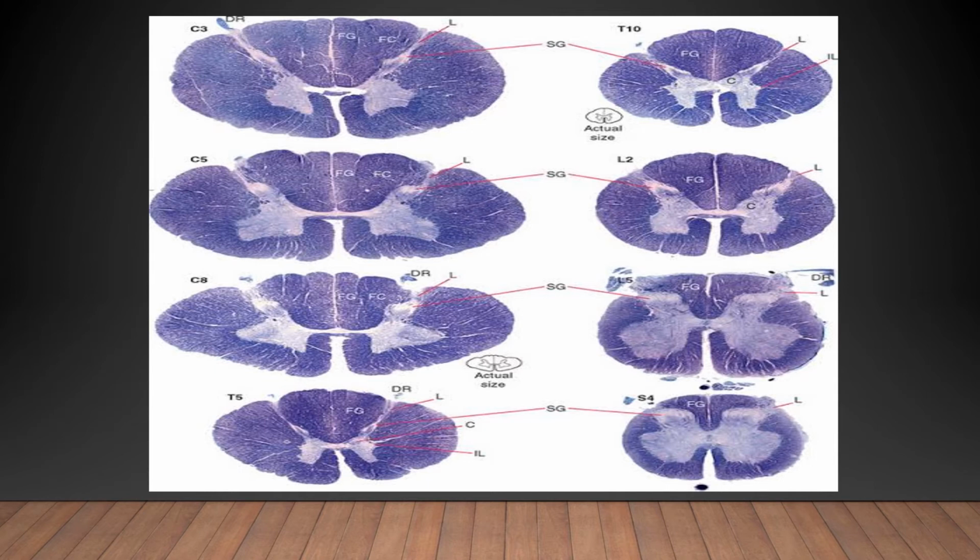The thoracic spinal cord will have slender anterior and posterior horns and a lateral horn and an abundance of white matter. The lumbar and sacral spinal cords will have prominent anterior horns due to supply of the lower limbs, a bulbous posterior horn, and a single dorsal column, with the difference being the ratio of gray matter to white matter.